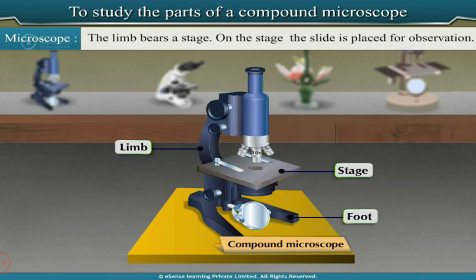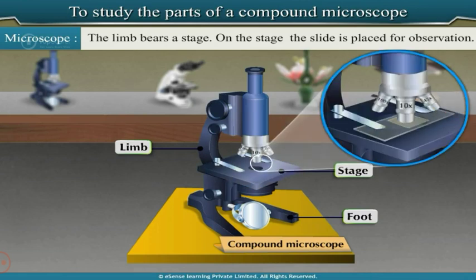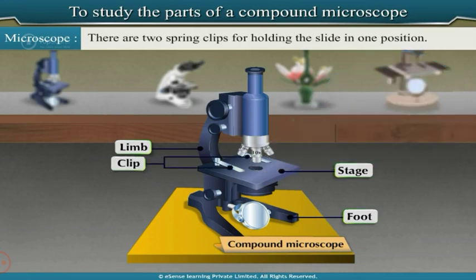On the stage, the slide is placed for observation. There are two spring clips for holding the slide in one position.